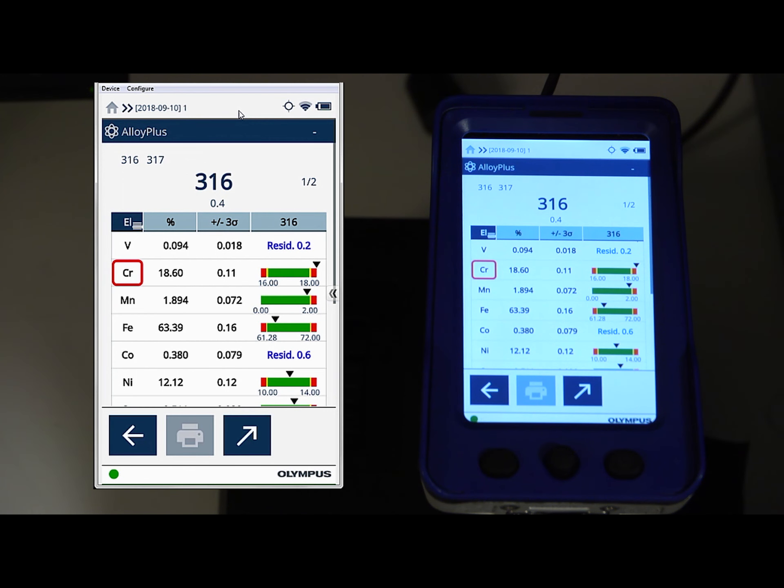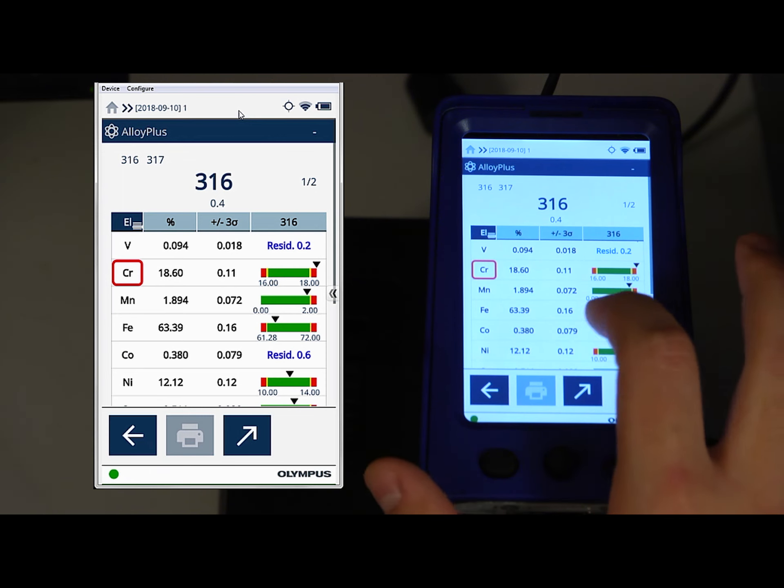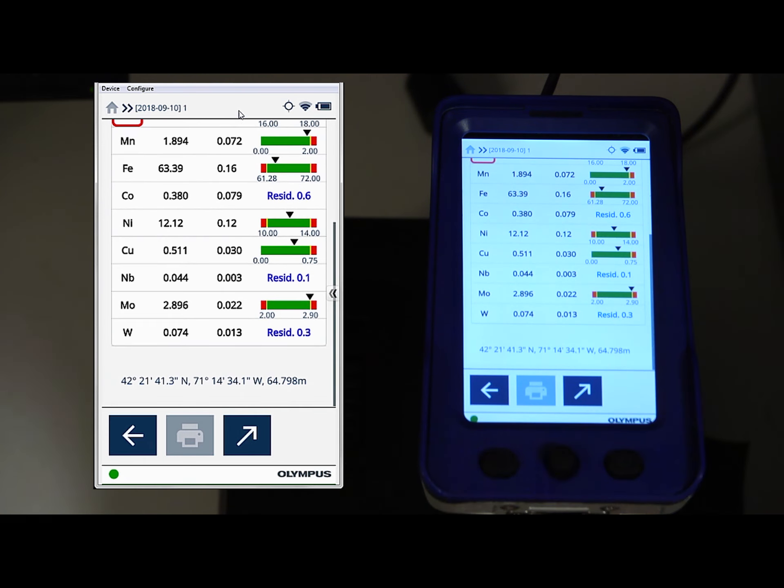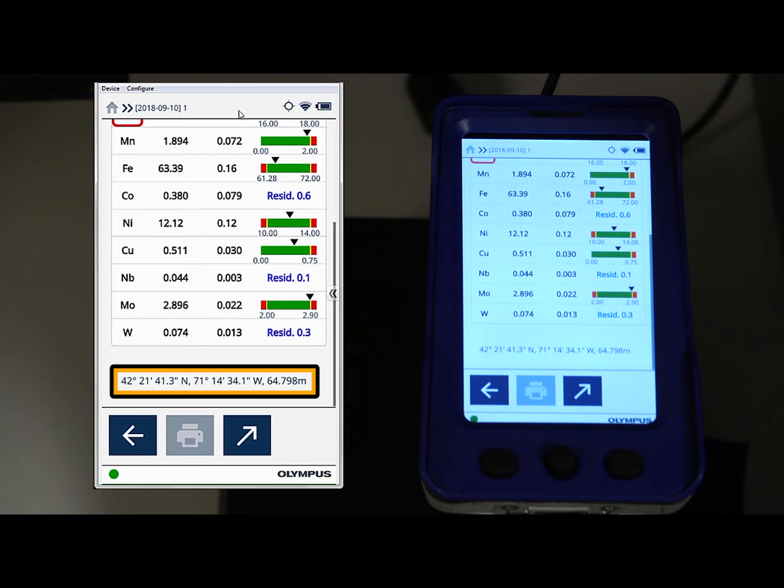During live testing, you'll see the elements present in your sample. If you scroll to the bottom of this, you can see the coordinates for latitude, longitude, and elevation from the GPS.